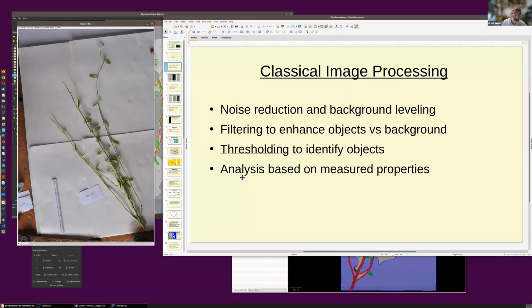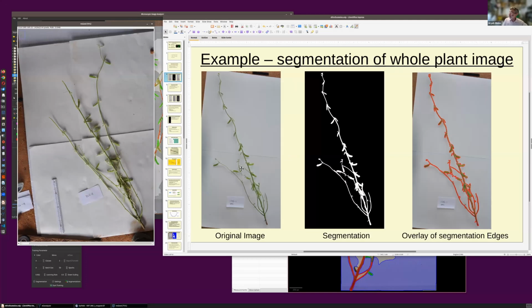And that's good. An example of that is when I wanted to identify the plant against the background. It's not a difficult problem, but it turns out that there are subtleties here, and each plant has different lighting or a slightly different morphology, or other artifacts occur. I had to write a program in Python that ran under the Fiji distribution of ImageJ, and you see the result.